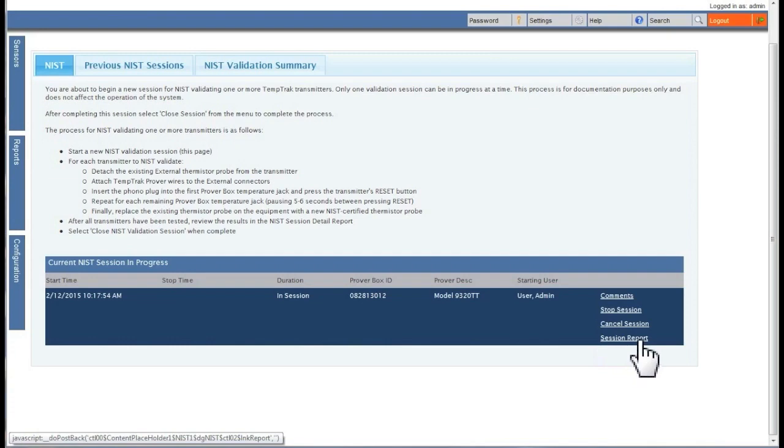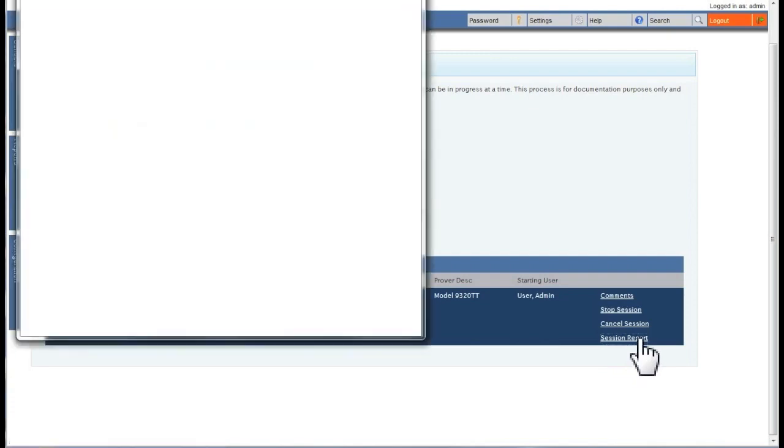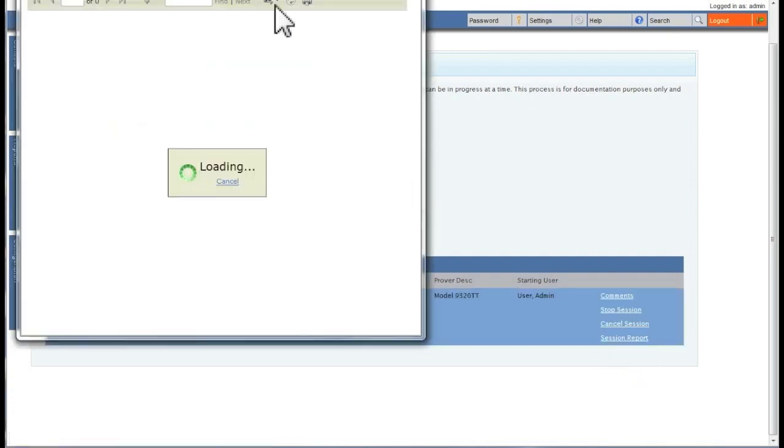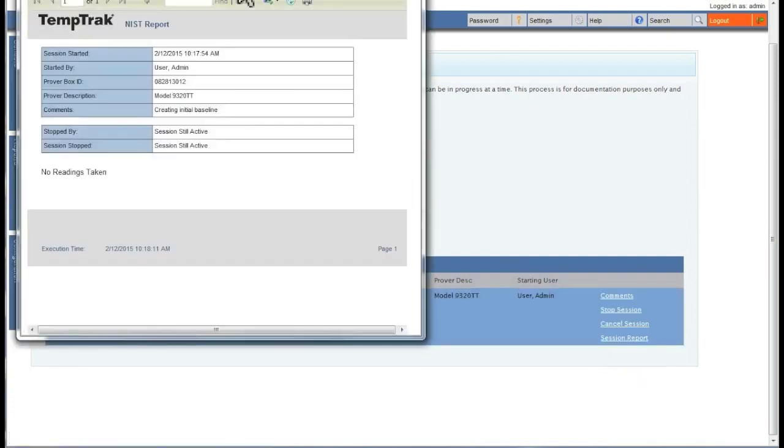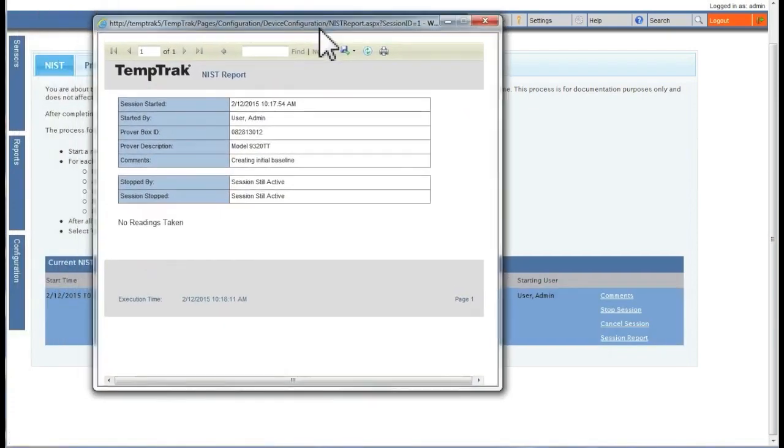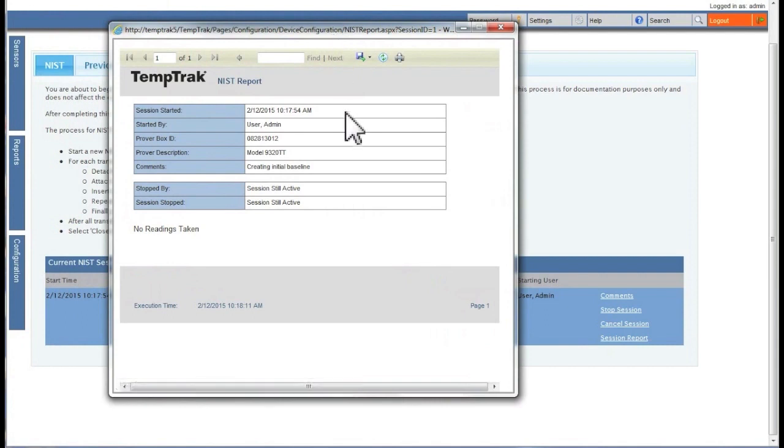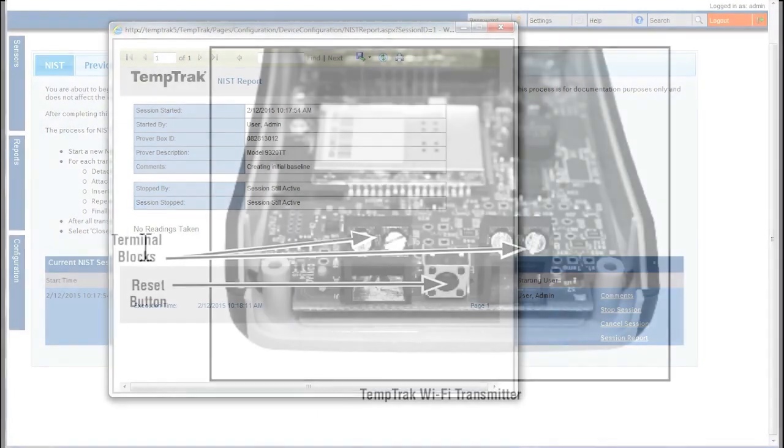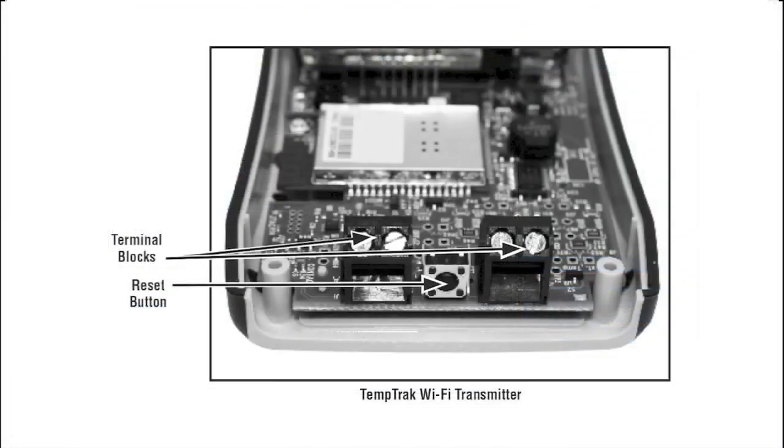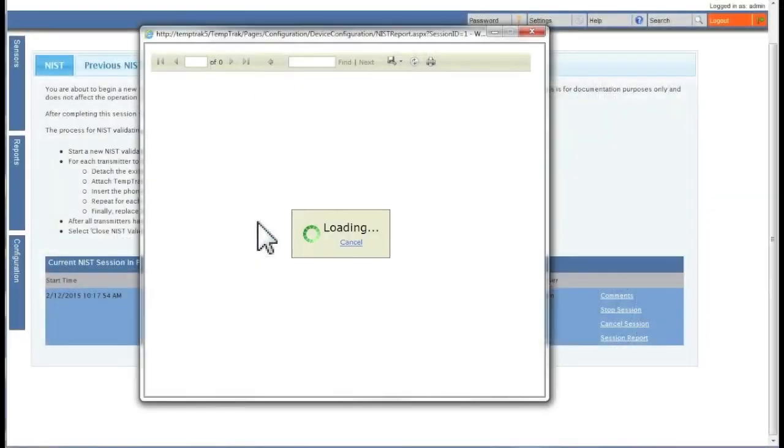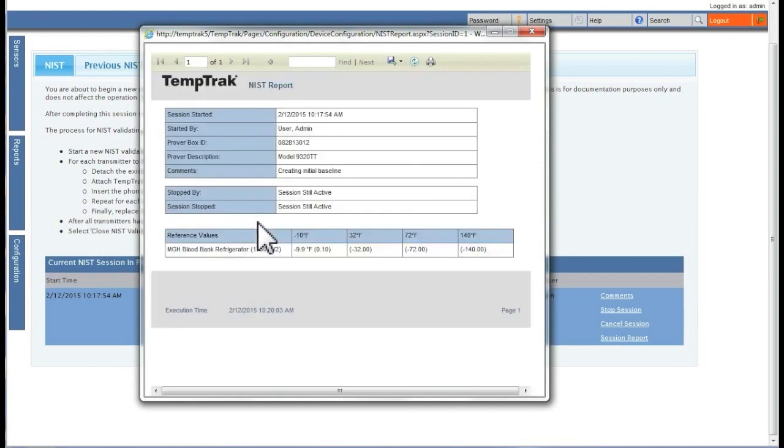If you click on the session report link, a report showing the current NIST validation session is displayed with any transmitters that have been validated. If you are in the middle of a validation of a transmitter, you will need to click on the reset button on the transmitter, and to refresh the data, you can hit F5 on your computer keyboard.